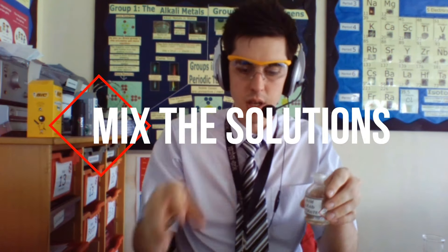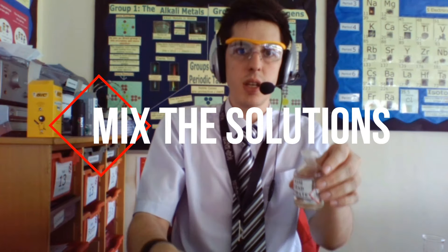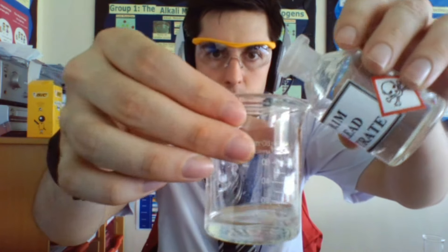The next thing you want to do is mix it with your other soluble salt, so in this case lead nitrate. Now you'll see straight away the precipitate forming.